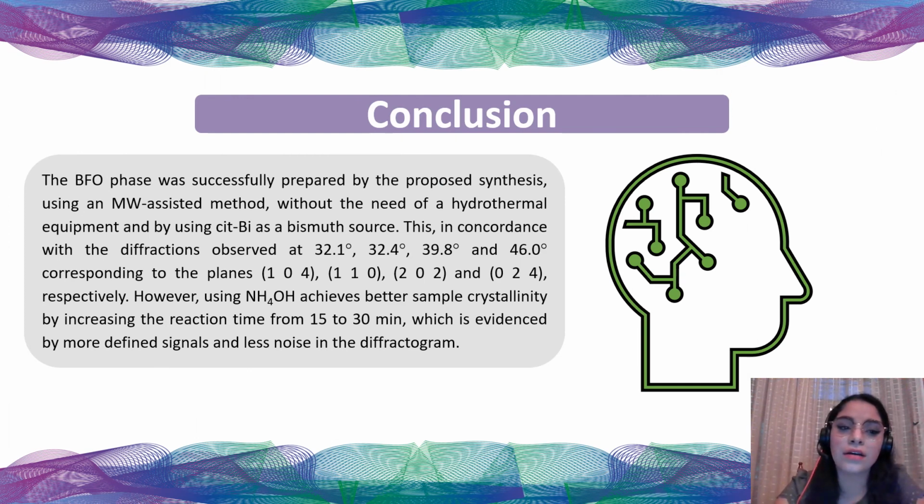In conclusion, the BFO was successfully prepared by this synthesis process, using a microwave-assisted method, without needing hydrothermal equipment, and using bismuth citrate as the bismuth precursor.